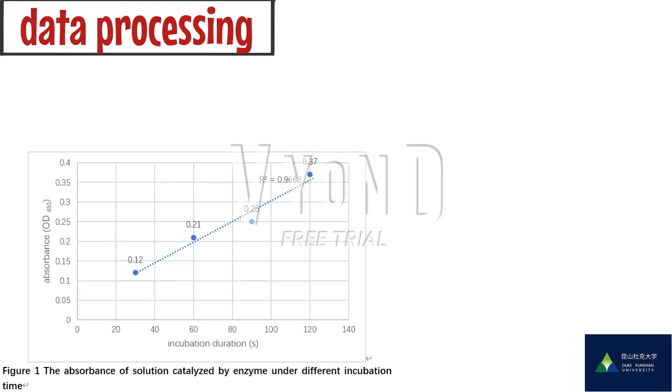Then, if we draw the absorbance incubation time graph by using the figure of average absorbance of solutions in each incubation duration, we can find that the line is approximately a straight line. This inspires us that the effectiveness of lactase is constant for every second of the incubation time. The mismatch on the 90-second point may be due to experimental error.